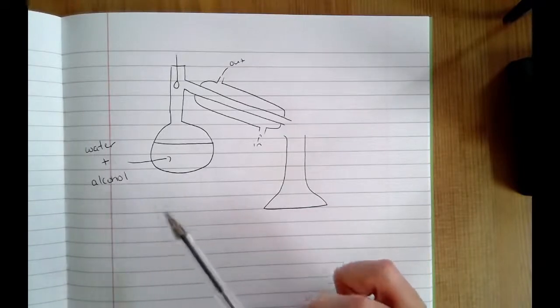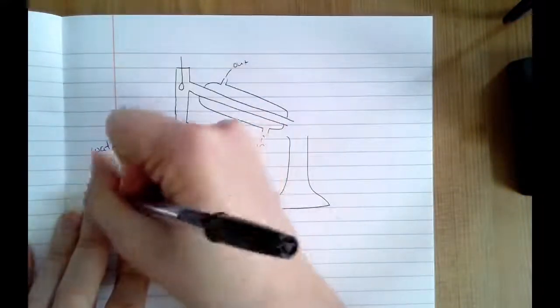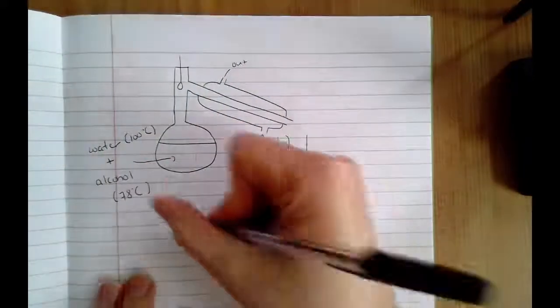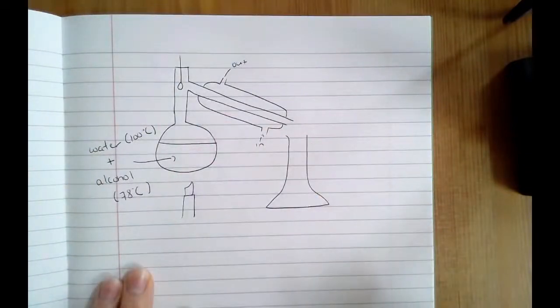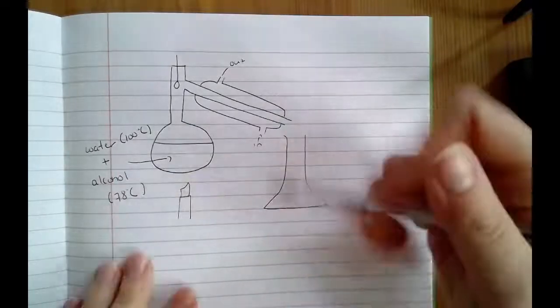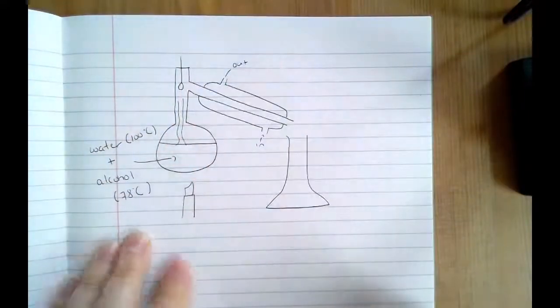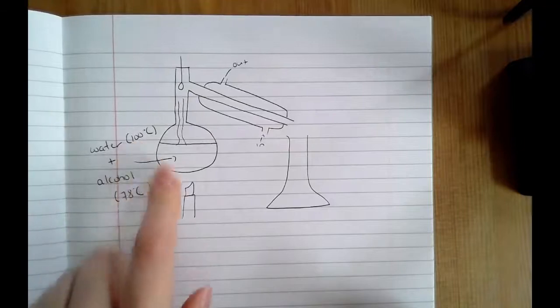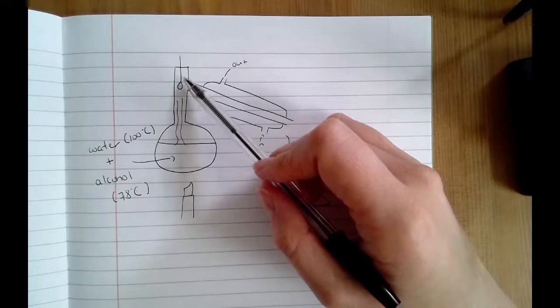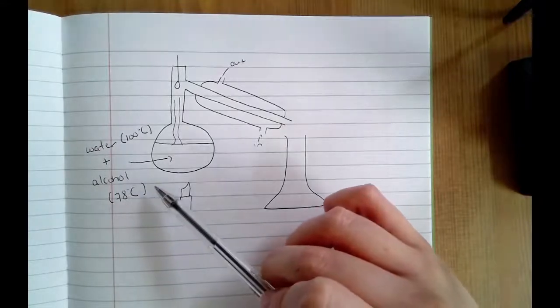So they're two different liquids. They mix together. We want to be able to separate them. Water and alcohol have different boiling points. Water boils at 100 degrees Celsius. Alcohol will boil at 78 degrees Celsius. If I heat my round bottomed flask to 78 degrees Celsius, then what will happen is the alcohol will be turned into a gas. The alcohol will evaporate, but as long as I don't hit 100 degrees Celsius, my water will remain as a liquid. This is when the thermometer becomes really, really important. You need to track the temperature.